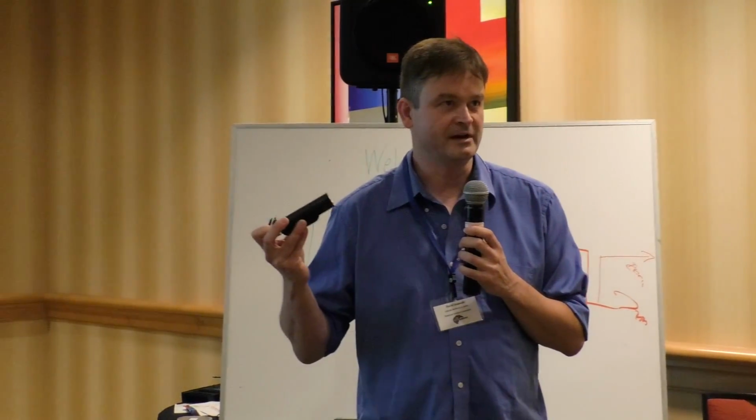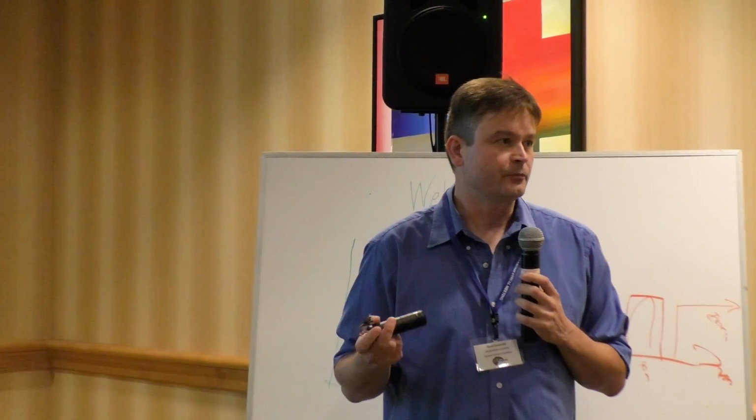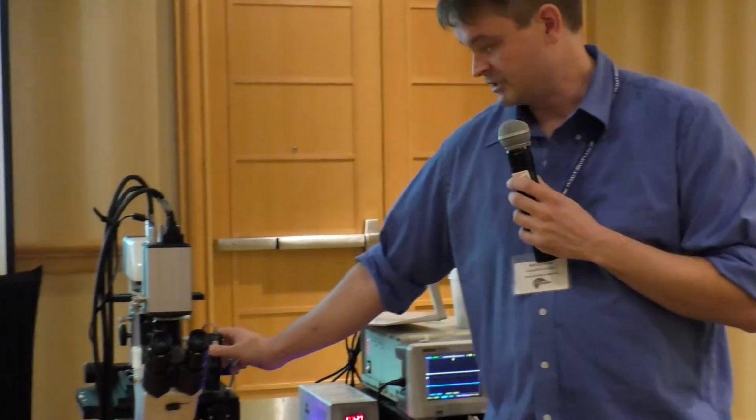So these are tubes that we're developing. They can do certain things already. They can't do other things yet. Now we're in alpha test phase. We've been to Andy Bauman's lab. We've been here to NIH to get an idea of what it is we need to do with them to make them applicable. Now you basically mount them instead of your objective.